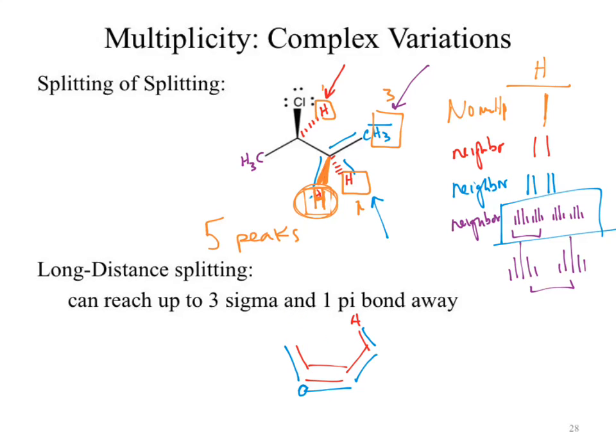I actually miscounted. That was supposed to be a hydrogen. So under this circumstance, we're 1, 2, 3 bonds away, we would say there's no splitting.